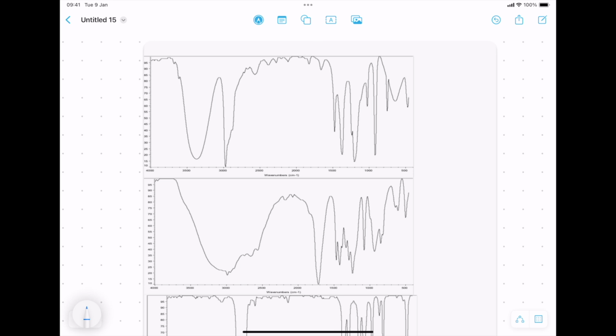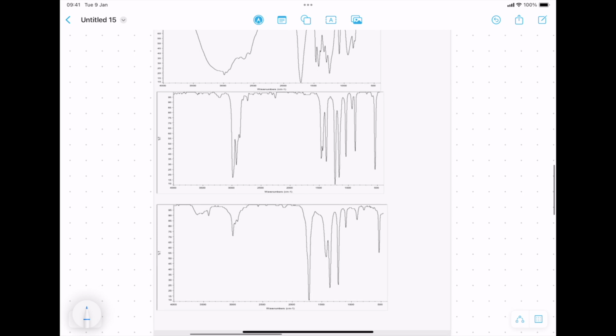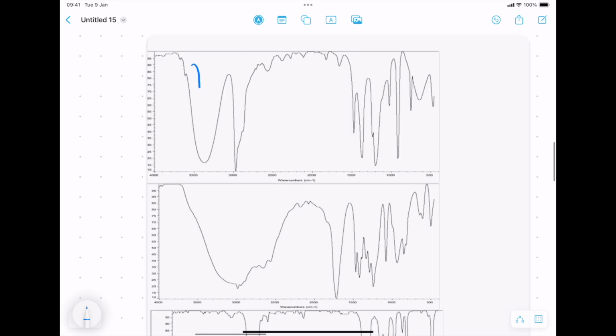If you remember, I said you can basically identify the spectra before you've even read the question and know the answer to the question, or at least part of it, just by the distinct shape of the spectra. So what I have in front of us is four different spectra. This one, this really distinct double dip, I said this is always going to be an alcohol, a dead giveaway that there's an alcohol OH functional group present in the molecule.